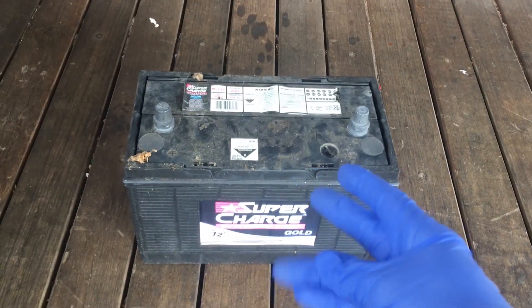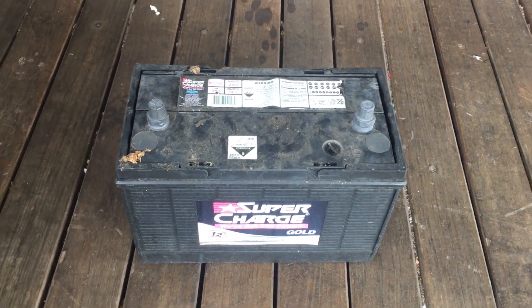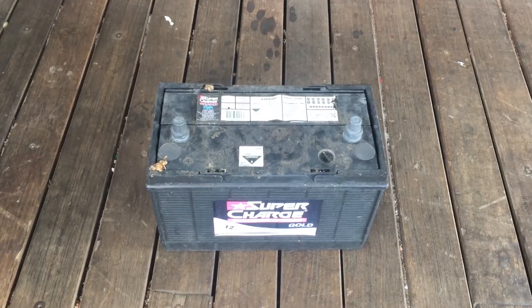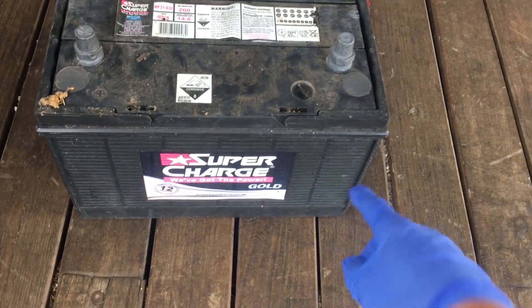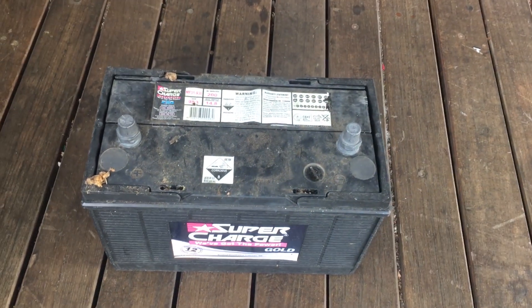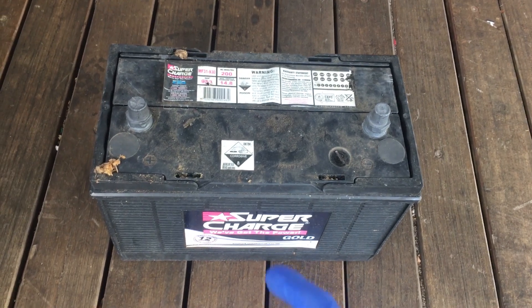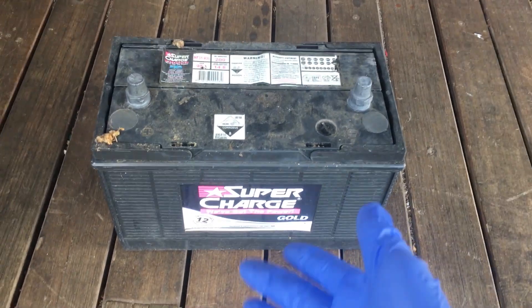So it's served us well, but we think it's about time to recycle the battery. I know a lot of people watching will probably want me to try to revive it using Epsom salt or whatever else people tend to try. But that is a lot of work, and out of the six 2-volt cells inside it, there must be at least two that are completely dead if we're only getting 8 volts. So it would just be a lot of work to try to revive a battery like this, and I definitely don't want to do that.